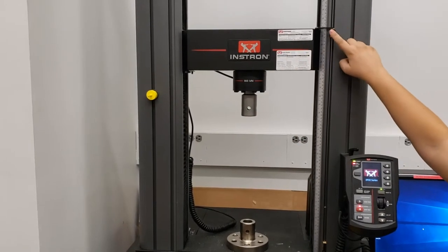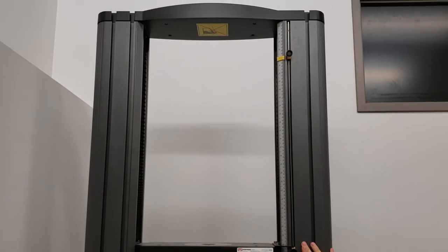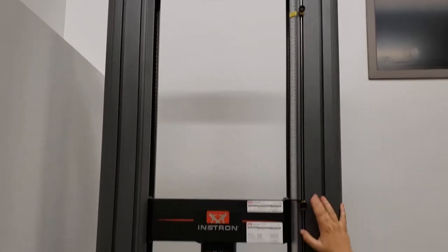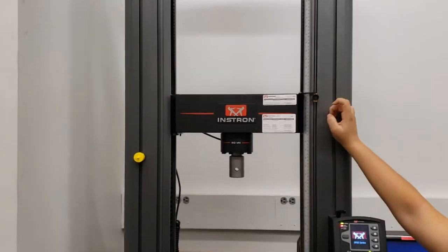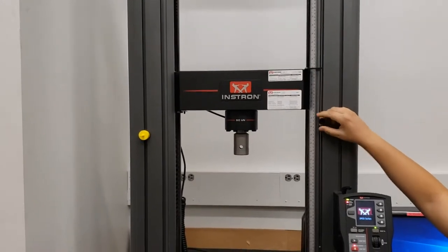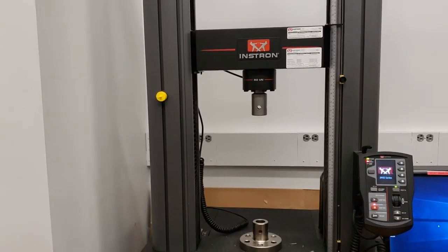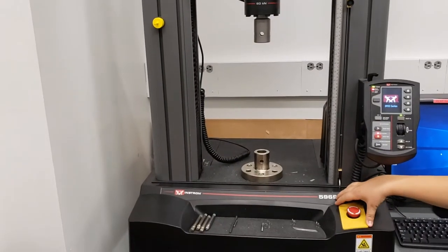We also have some physical stops. There is one here in yellow, and then one all the way up at the top of the instrument as well. These provide a safety if the crosshead travels too low or too high, and they are readjustable. If the crosshead travels too low or too high, it will trip these sensors, which will come down into here and activate an emergency stop.